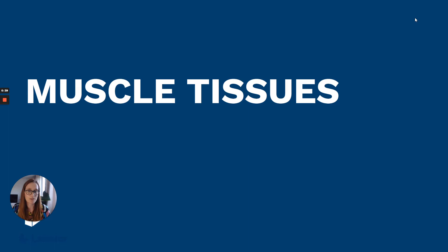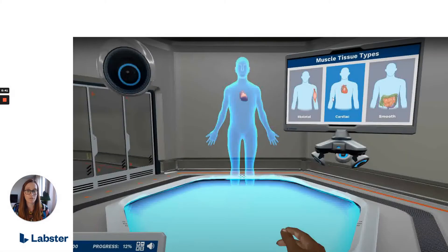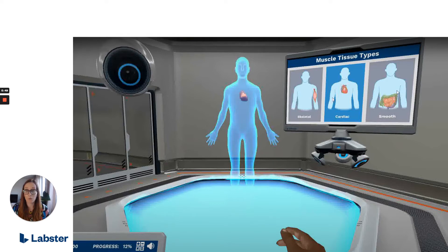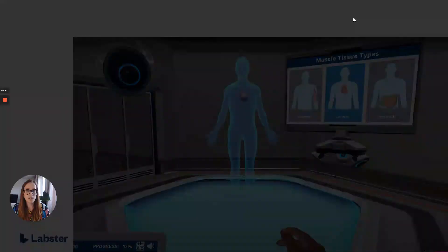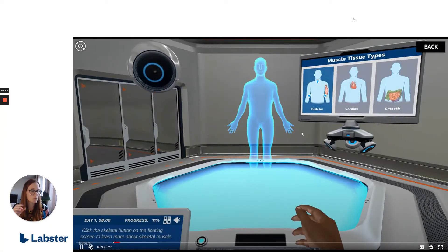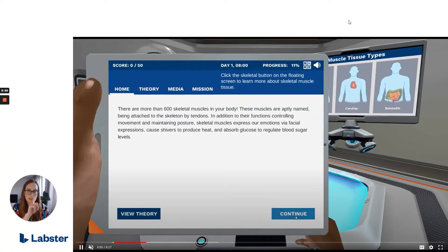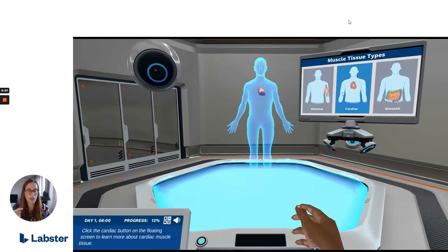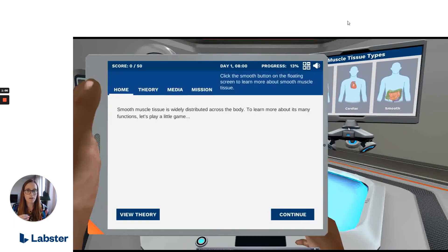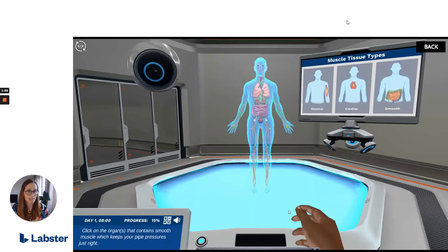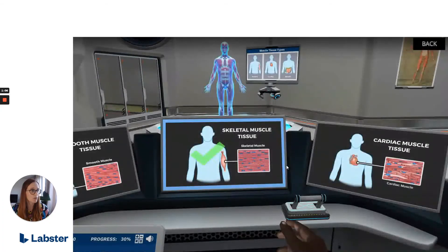In our Muscle Tissue simulation, we improved the overview of the muscle tissue so users can now move directly to a small hollow floor with a body and floating screen in one view. We also increased the size of the human model and highlighted different organs to help improve user focus. The user is now able to move directly from that scene to the bench with three screens in one view in order to complete their tasks and activities.